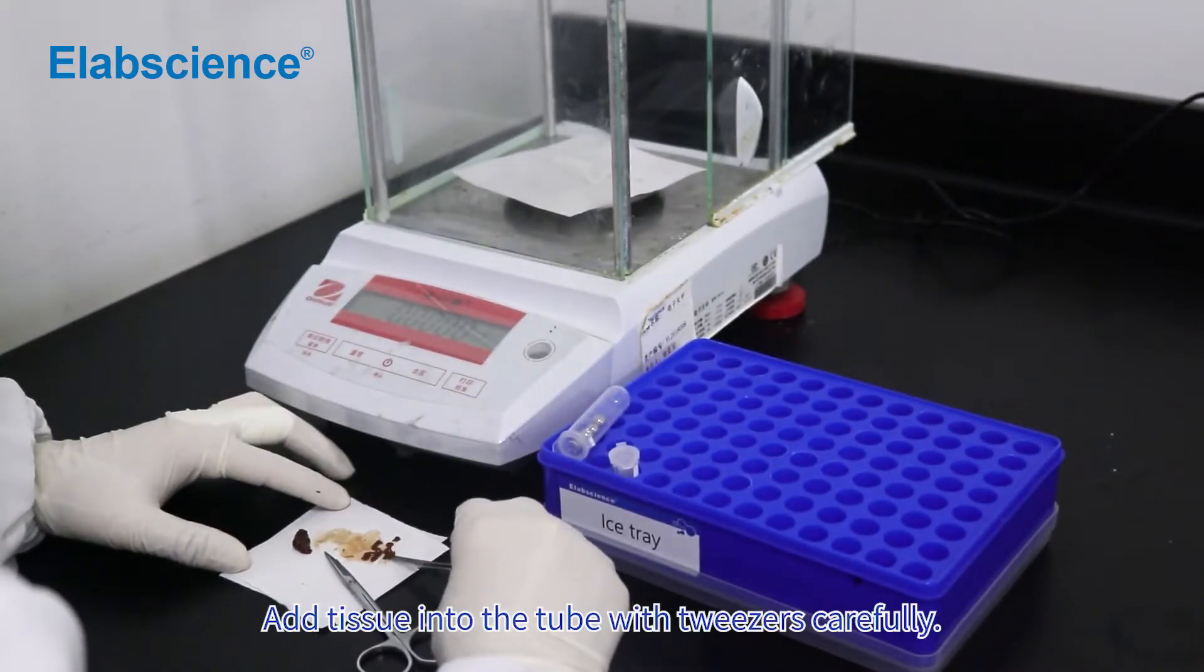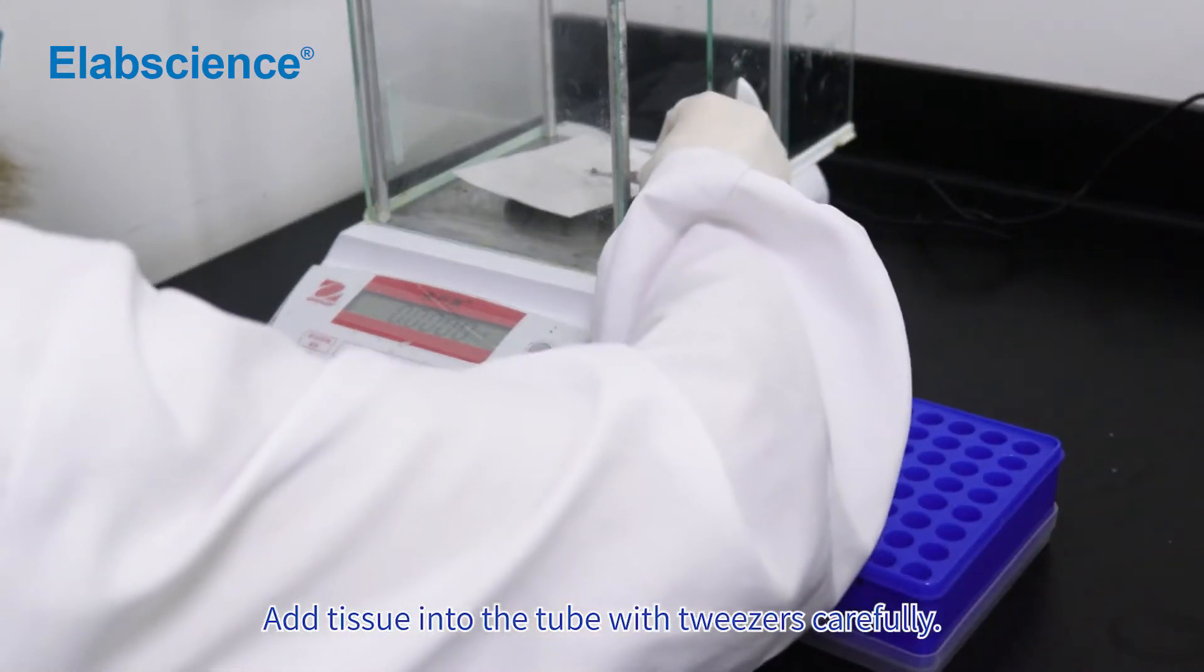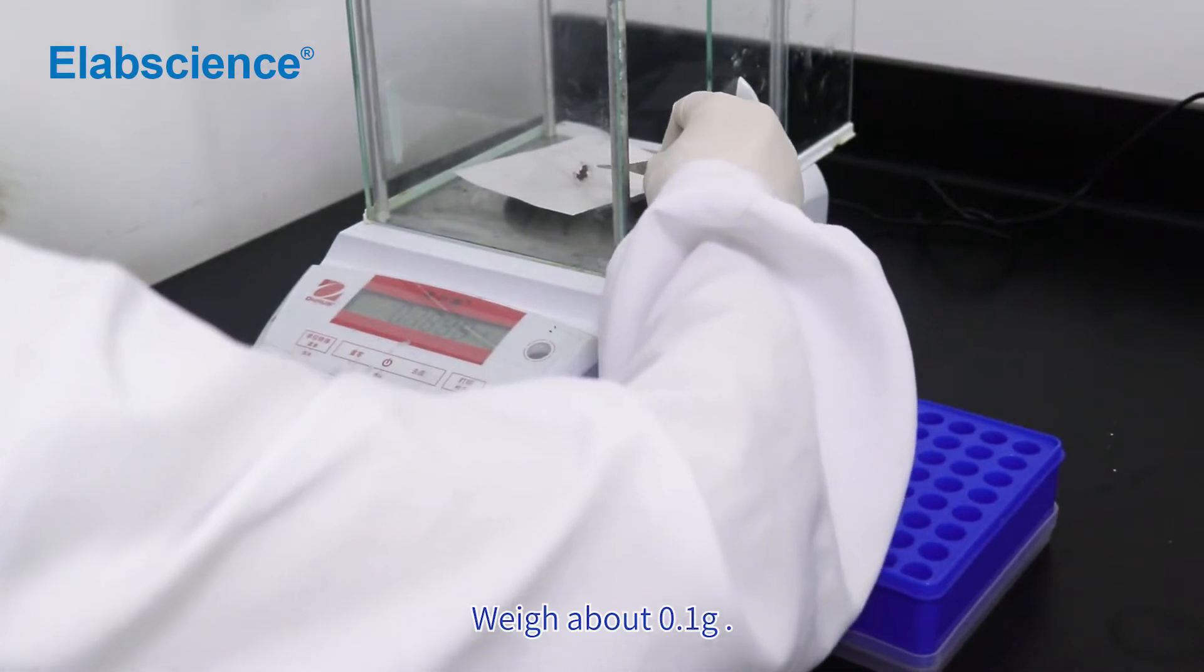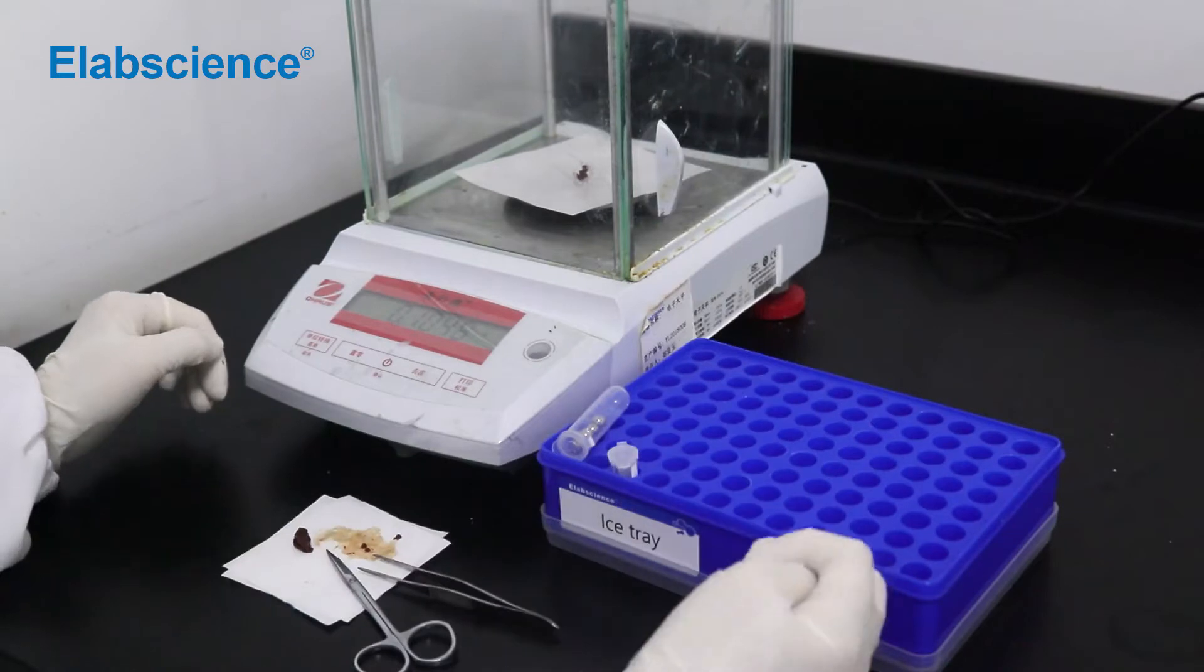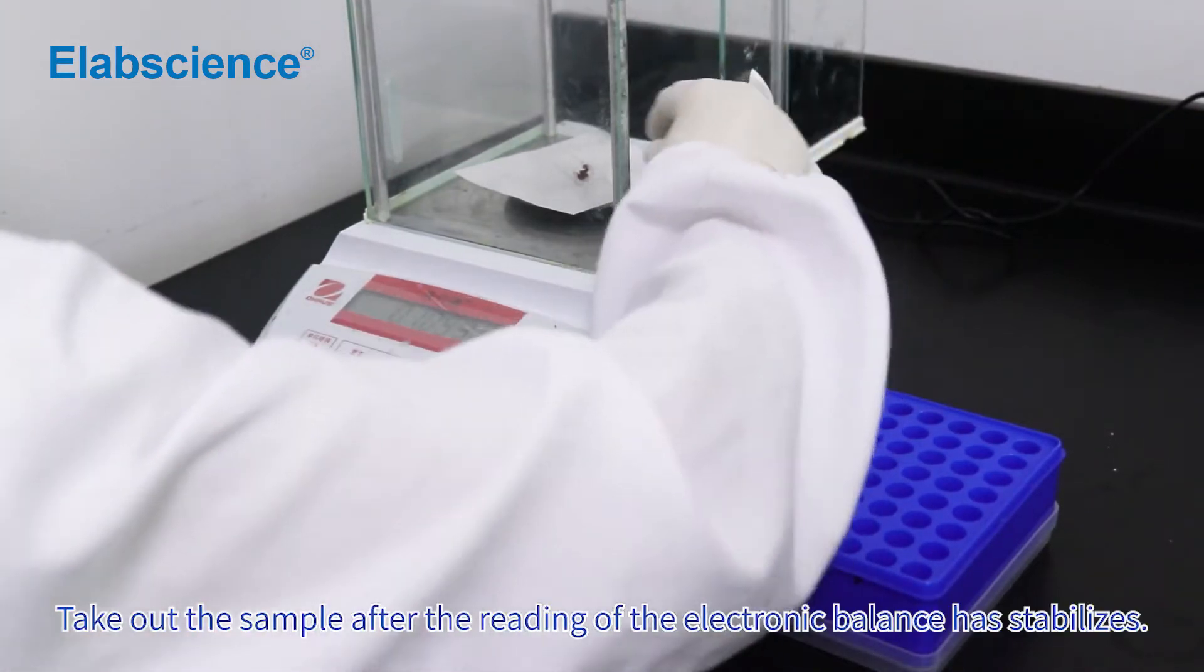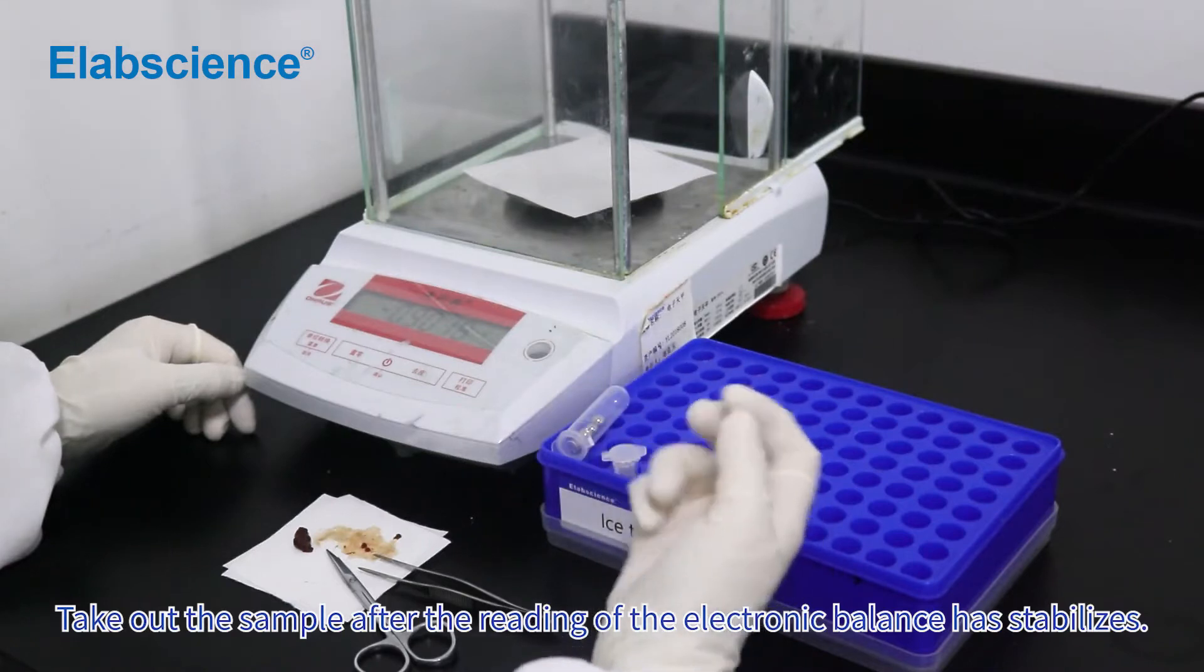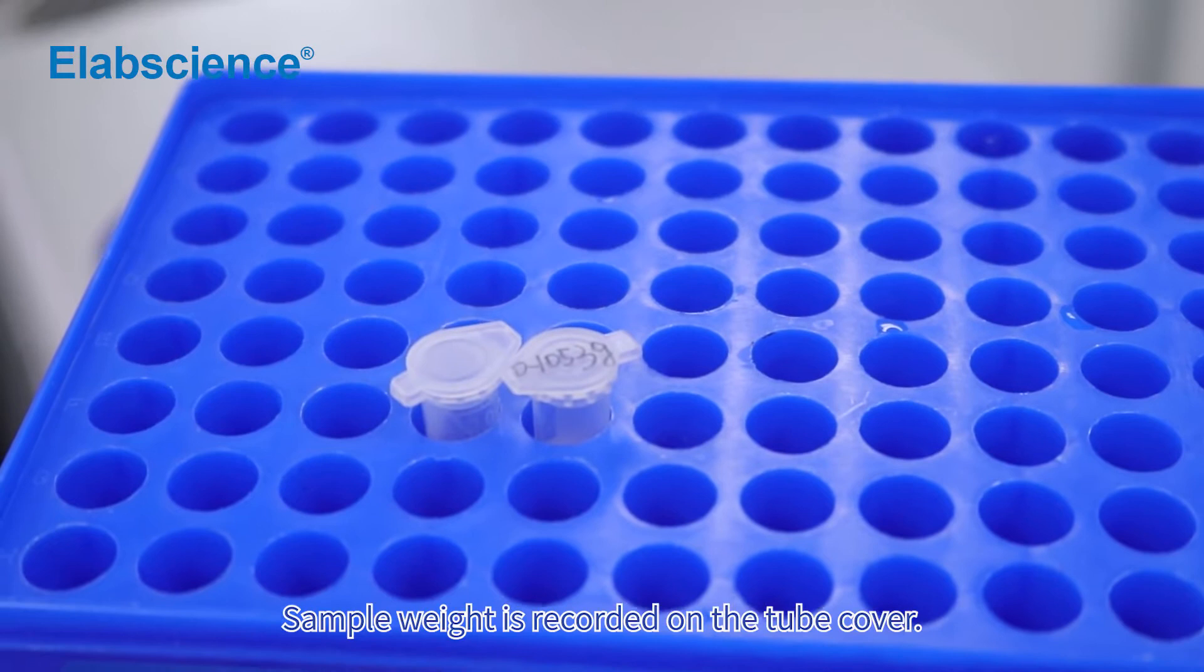Add tissue into the tube with tweezers carefully. Weigh about 0.1 grams. Take out the sample after the reading of the electronic balance has stabilized. Sample weight is recorded on the tube cover.